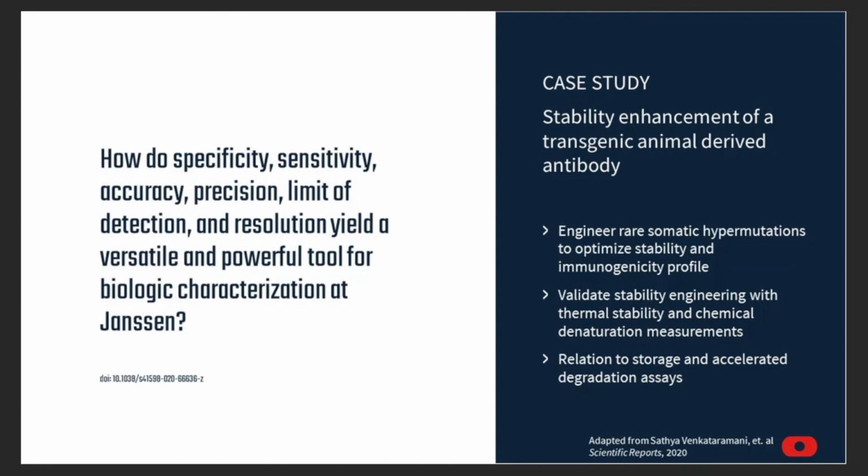Or, in a case not quite as early stage, where we're performing some sort of protein engineering work, which Jie actually featured quite nicely in his presentation as well, looking at the different constructs and different mutants, here is a publication from this year from a group at Janssen, talking about how they are engineering in some stability enhancements of this transgenic animal-derived antibody, and how these same instrument properties that Jie was featuring previously really impact their work and help to facilitate and enable that. And of course, if you're interested, there is the DOI for that publication as well.